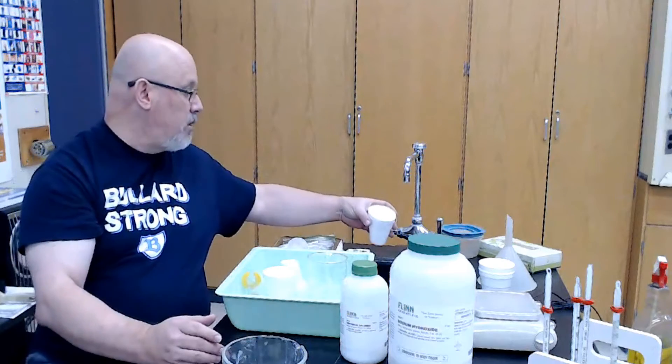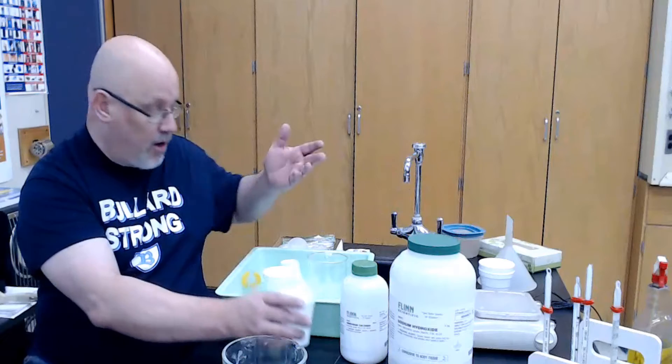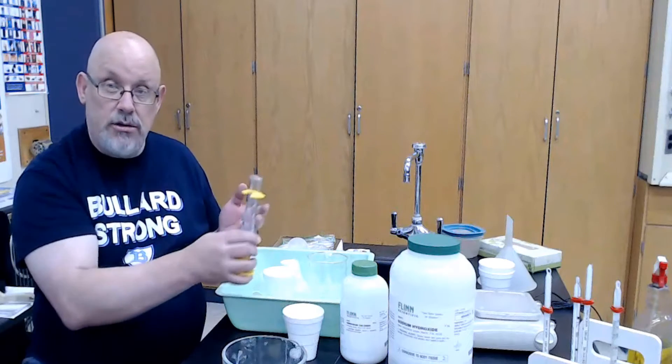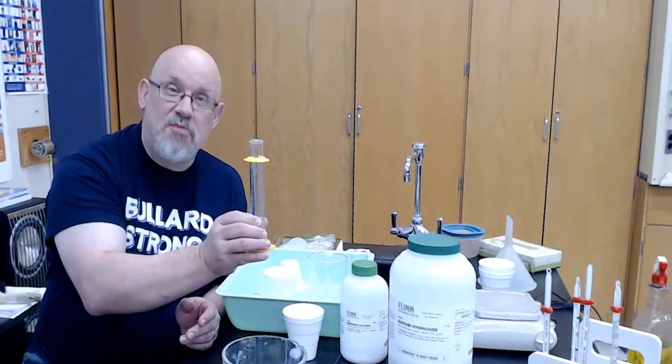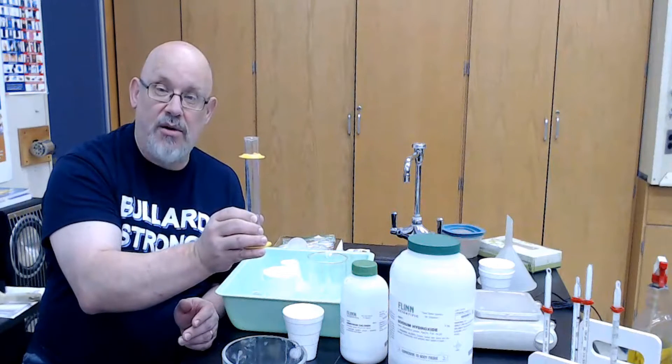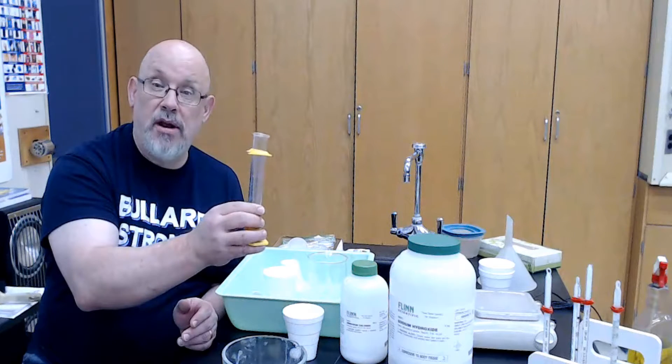We would rinse off the thermometer, we would dump out the contents of that and we would fill it up again. Now to accurately measure the amount of water we measure in the first place, we use a graduated cylinder, which is just a tube that has markings on it to tell us how to read it accurately.